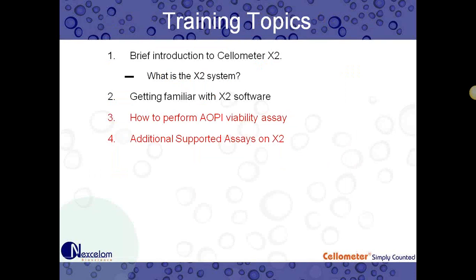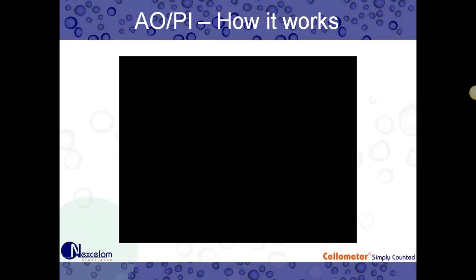So now we'll go over the AOPI viability assay. Okay, there we go. So quickly, we're going to review the AOPI video and how this works. This can also be found on our website. Let's get this playing for you.